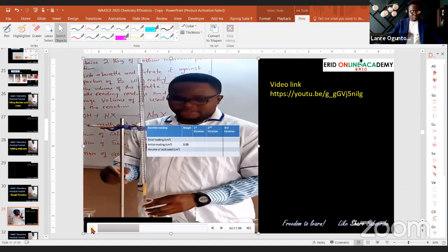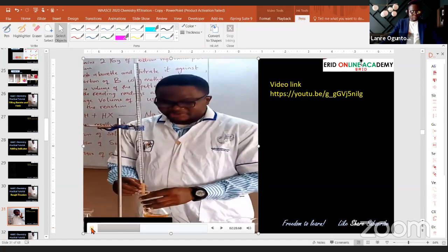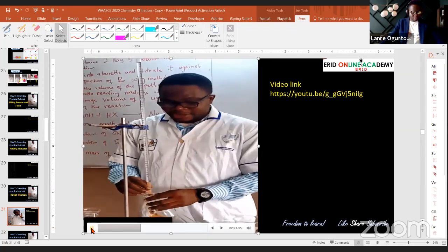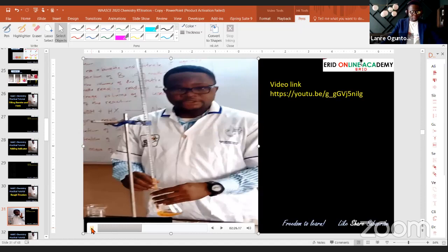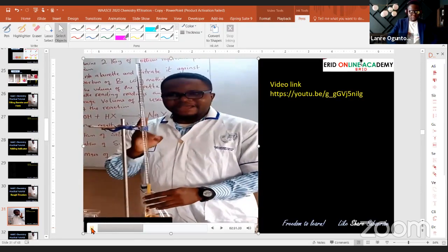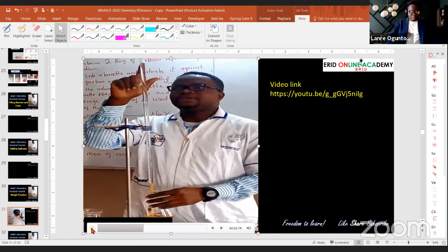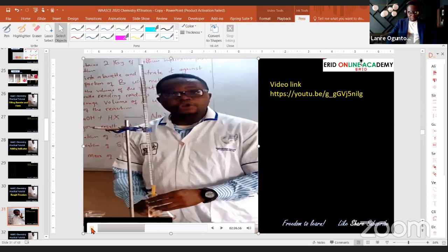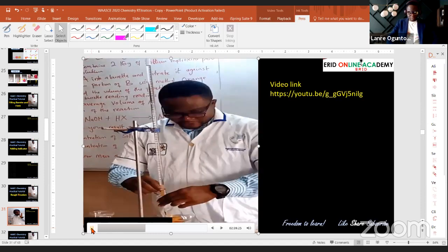So you can just be as rough as possible. That means you want to pour your acid into the base quickly. So now I want to pour my acid into base. When I'm doing my rough, the focus of my eye will not be here. My eye will be focused on observing the color change. Okay, so I'm focusing on this.